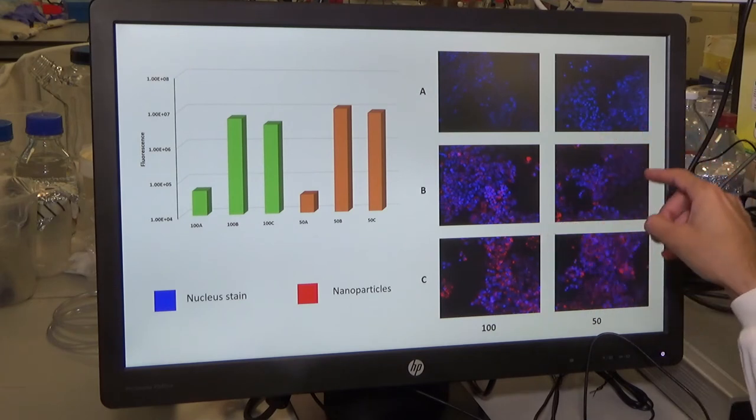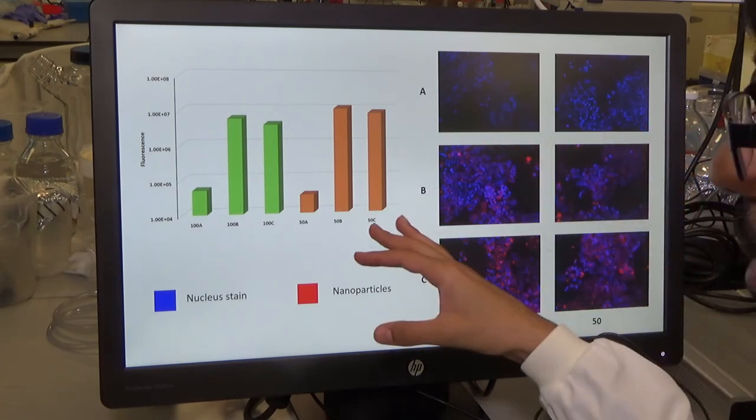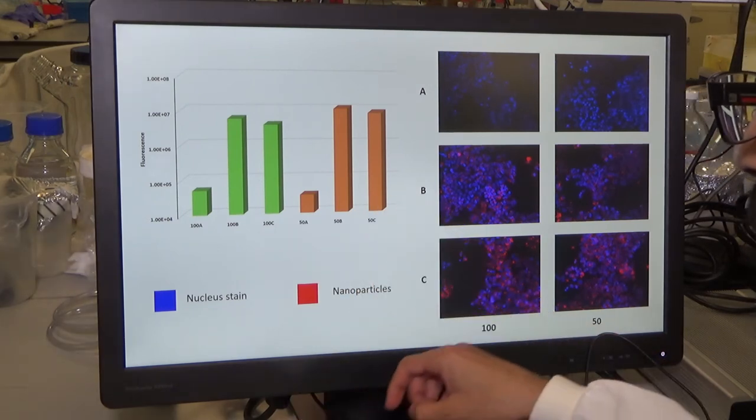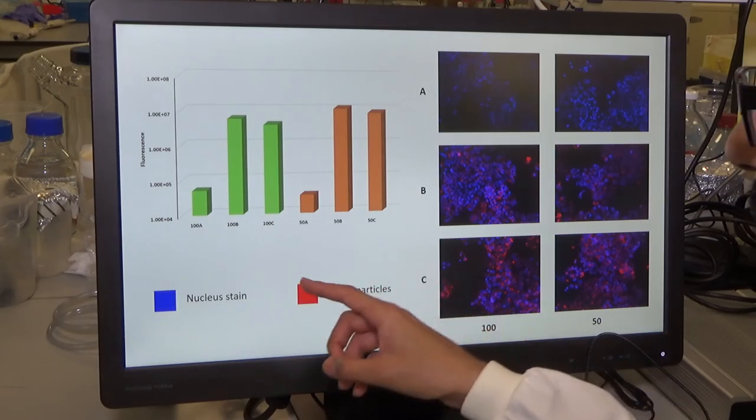And using a secondary mask, we can transfer this data to this graph, which represents the number of nanoparticles entering into the cells. So what we're looking at is how different physical properties of nanoparticles affect the cell uptake.